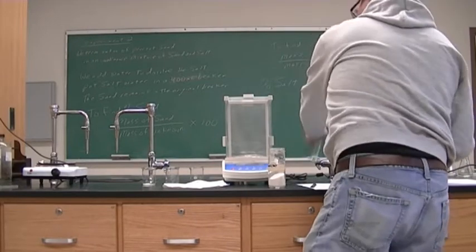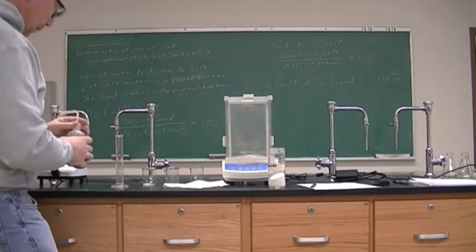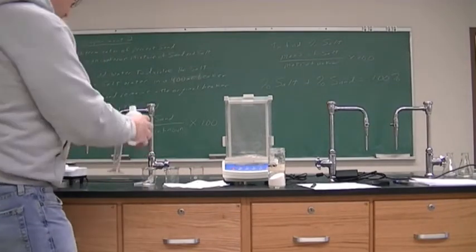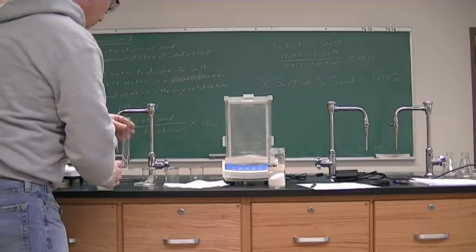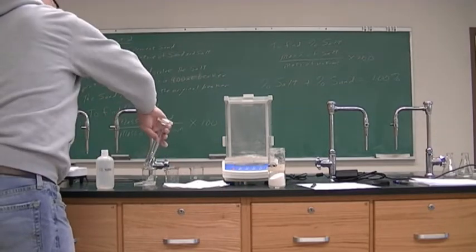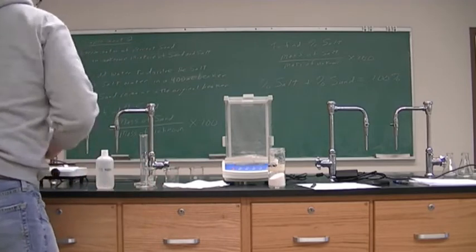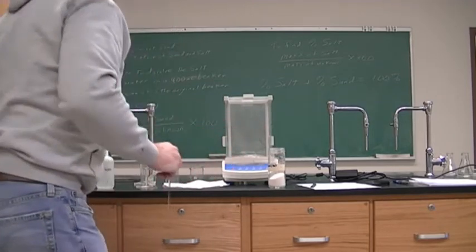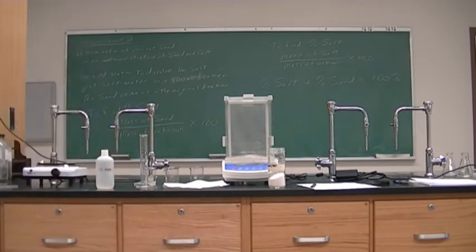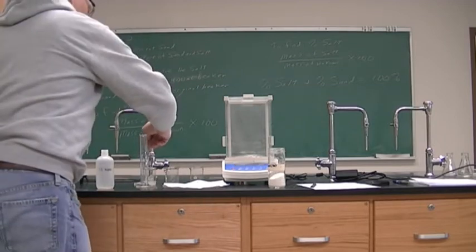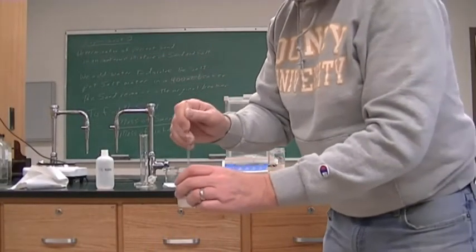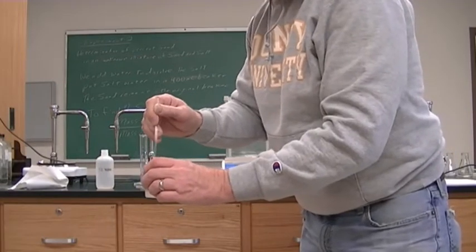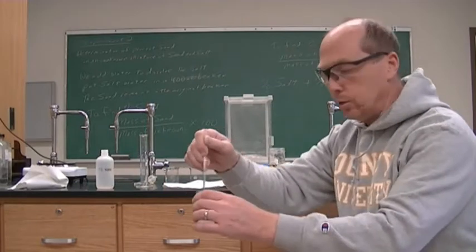To that, we're going to add 15 ml of deionized water. I'll put in about 15 ml — the amount is approximate. Then we will get our stirring rod and make sure it is wiped clean. We will stir this, and all of the salt is dissolving in the water. Remember, the sand will not be dissolving in the water — the sand is staying behind.